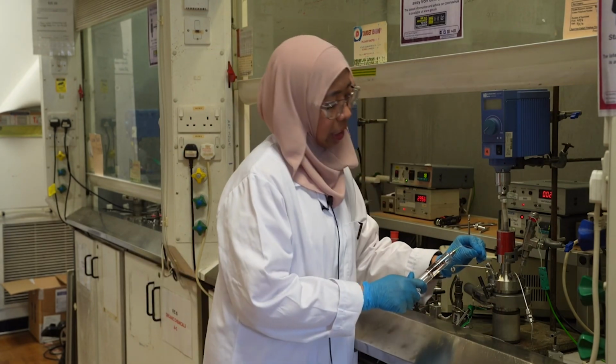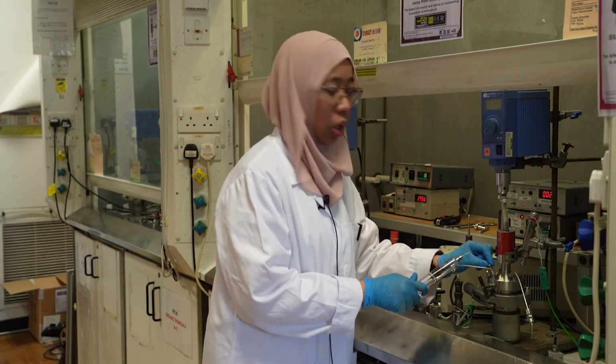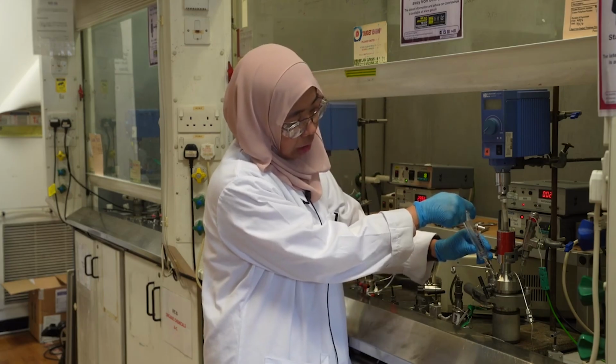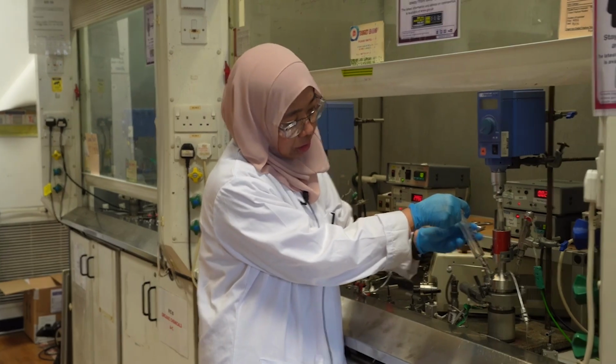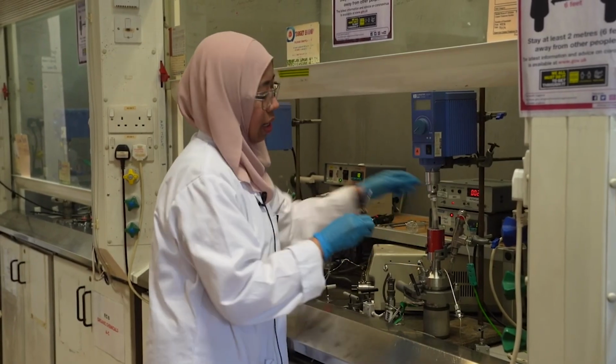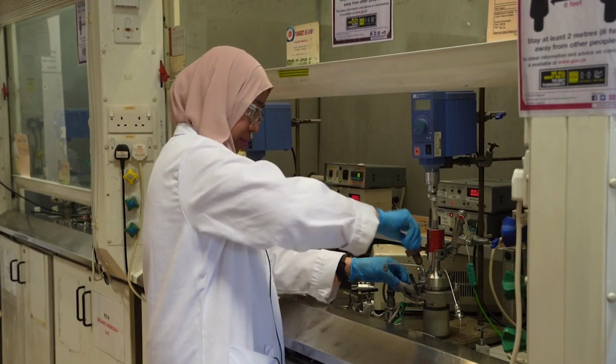So we will inject the reactant through the holes. We have to remember that the autoclave is under pressure, so please do it properly and slowly, and then take the key, okay, and then seal it back.